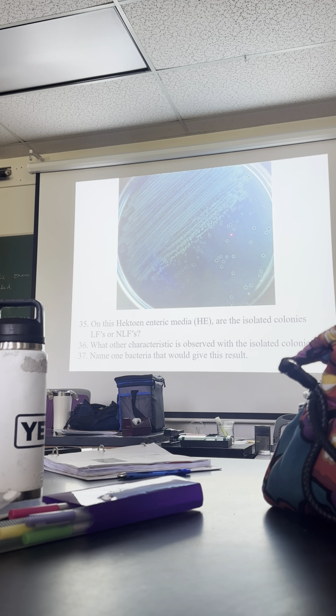So here, if we look at this colony, we have a blue-green background, and there's a colony with a dark center, it's black. What are the results for this colony? There are two parts to it. Lactose non-fermenter, you can't say negative, lactose non-fermenter, and H2S positive. That's correct.